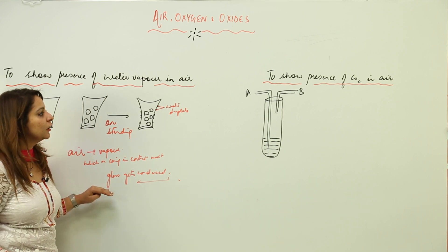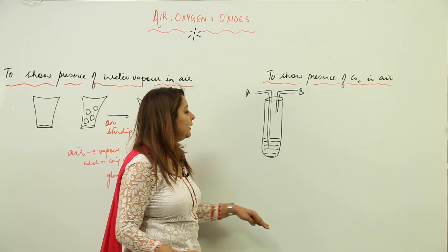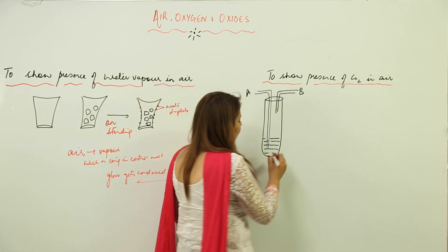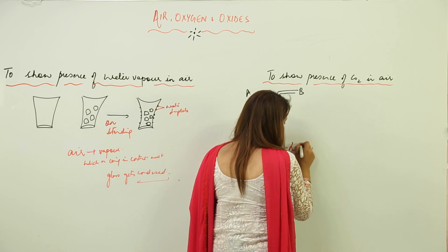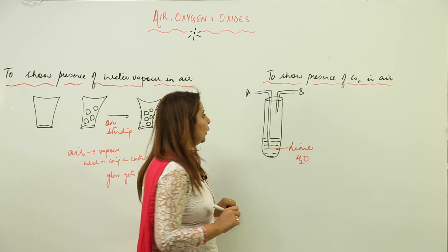Secondly, we are going to show that air also contains carbon dioxide. What we have done is taken lime water in a test tube which has two tubes, A and B. With the help of tube B, we are sucking in air.